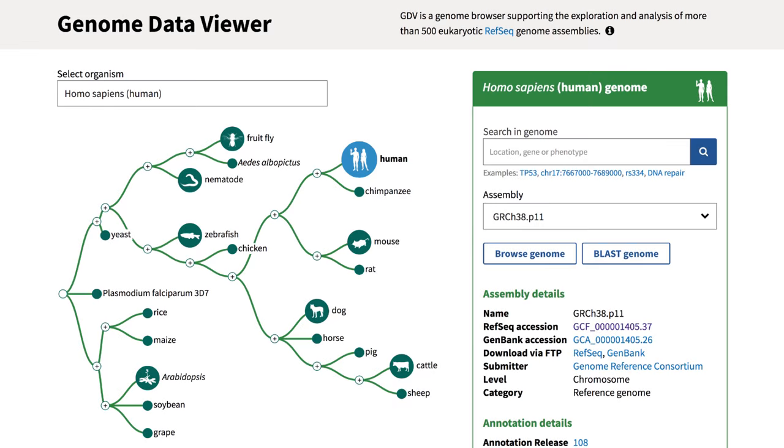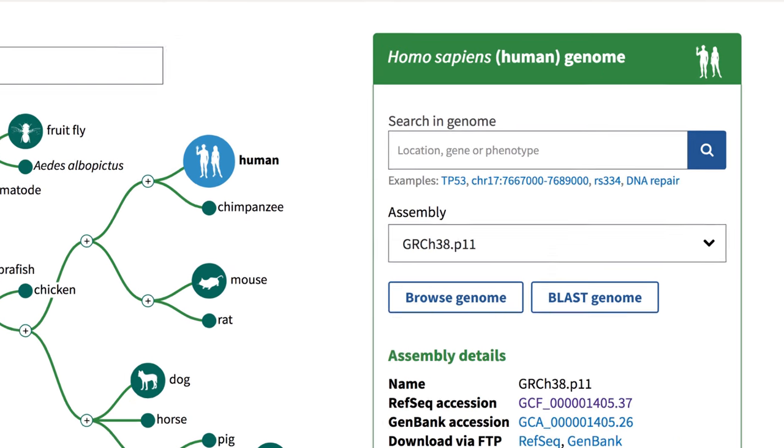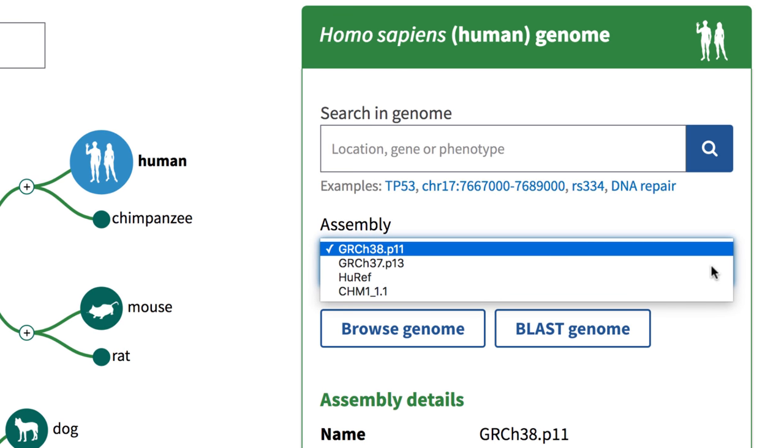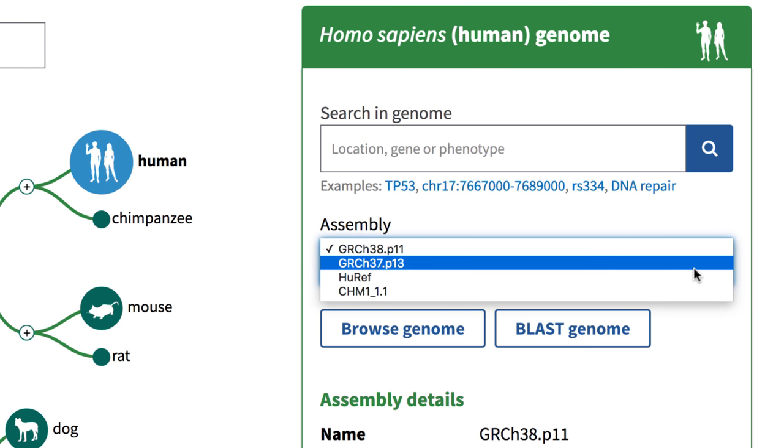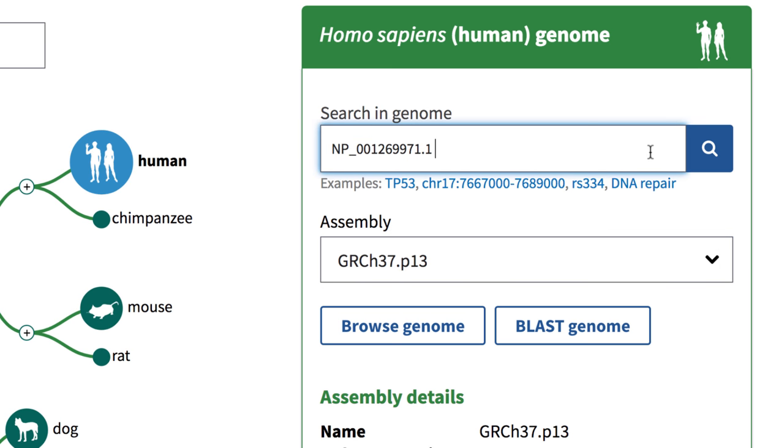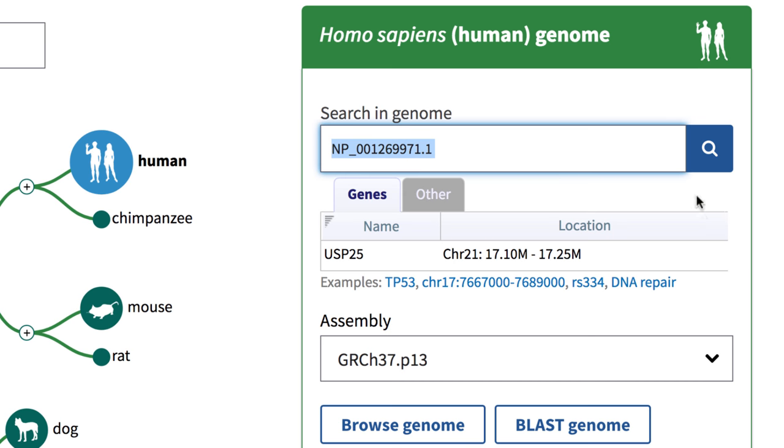You can begin your analysis of a particular assembly by entering a gene, a location, a phenotype, or even an NCBI accession number.